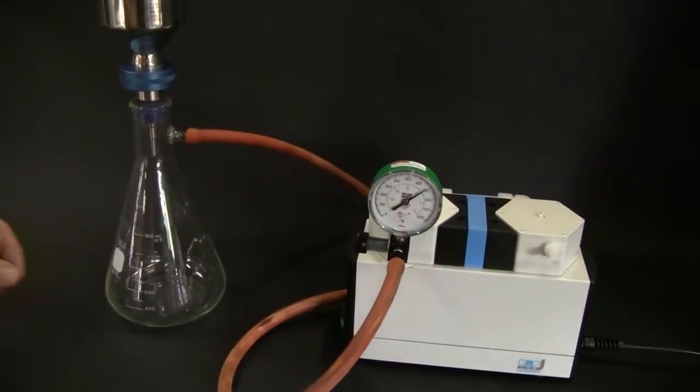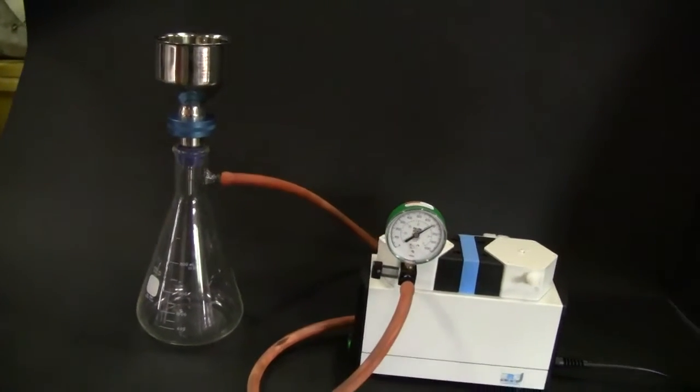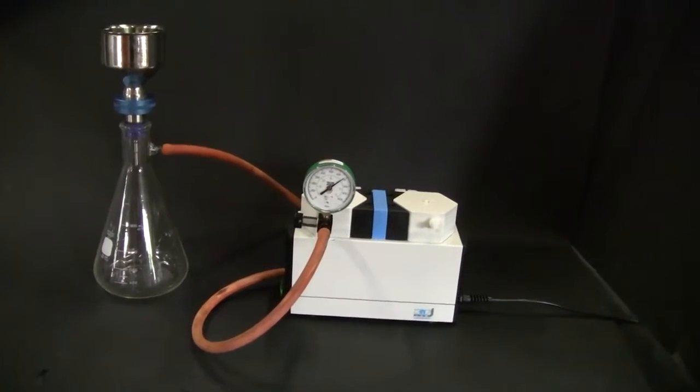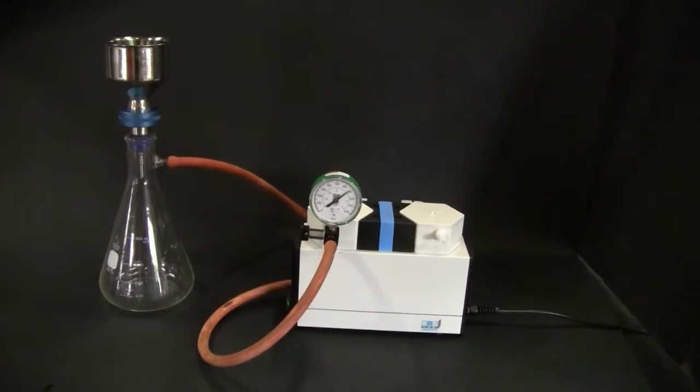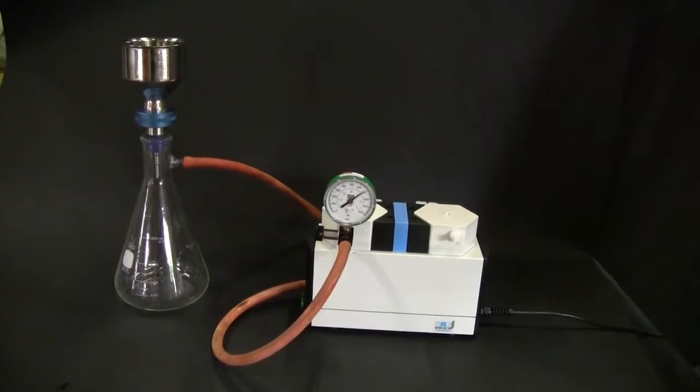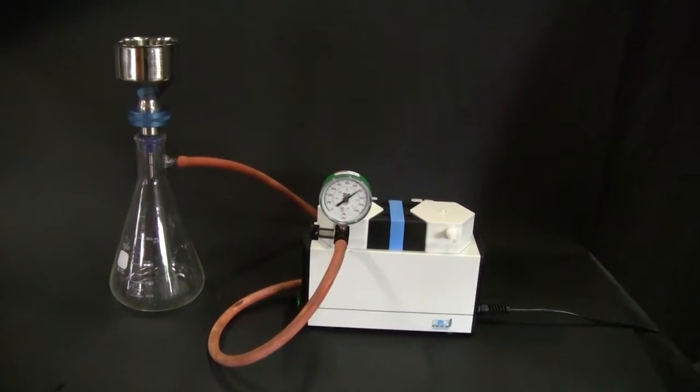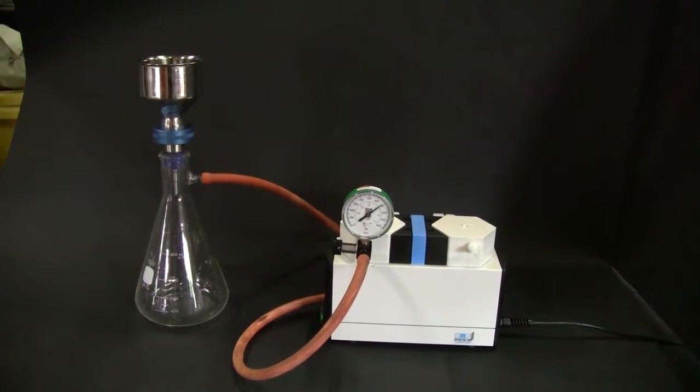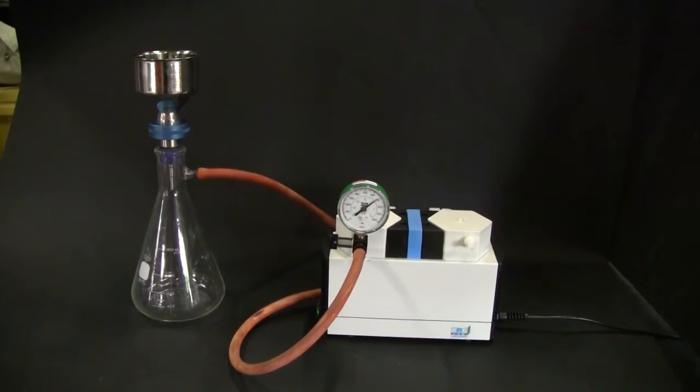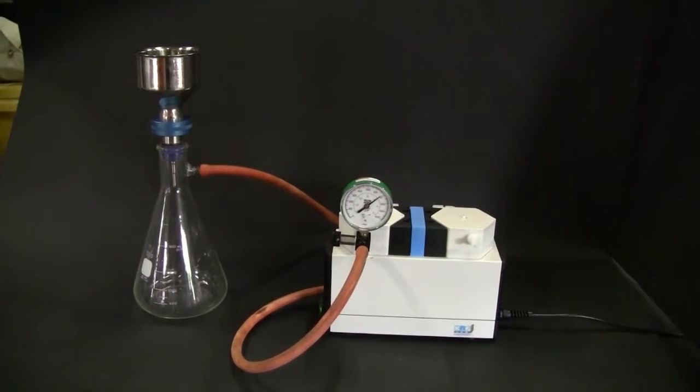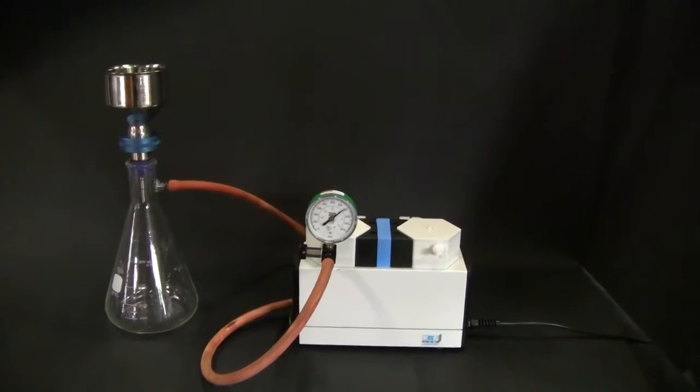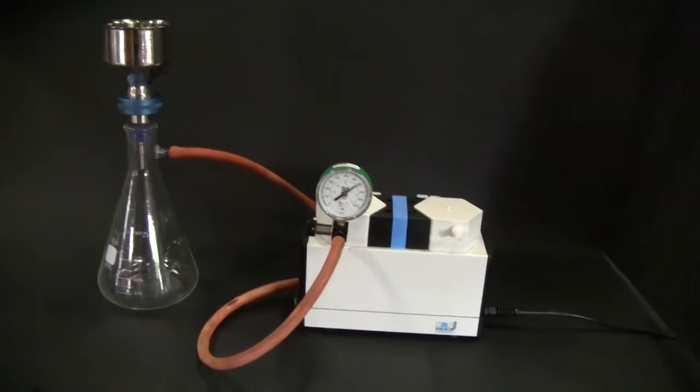What this package does, it makes it more versatile for the complete lab. You can be using the KNF pump for a rotovap and pulling 10 millibar, 6 torr on it, or you can take it off, put it on a quick filtration application, and adjust into that 700 millibar setting.